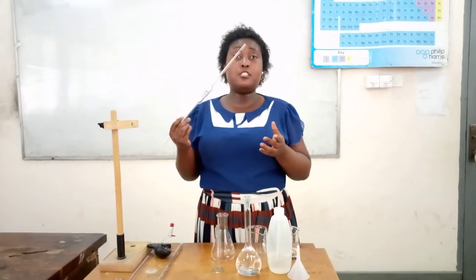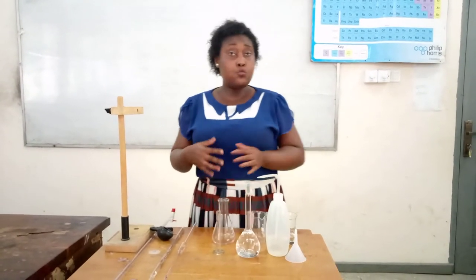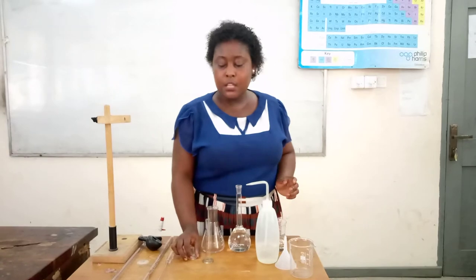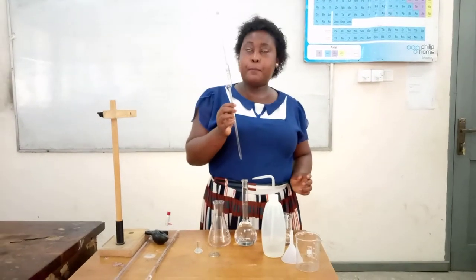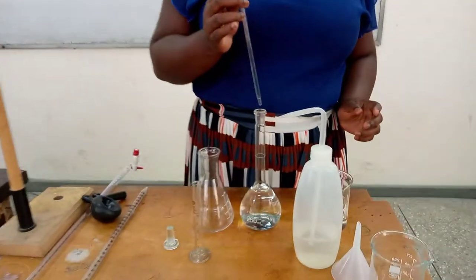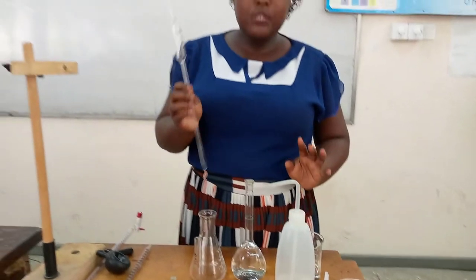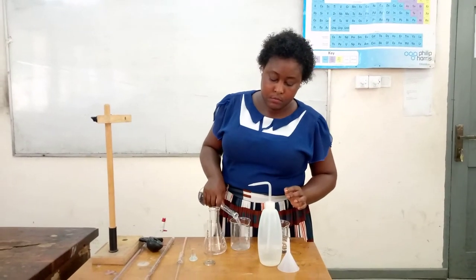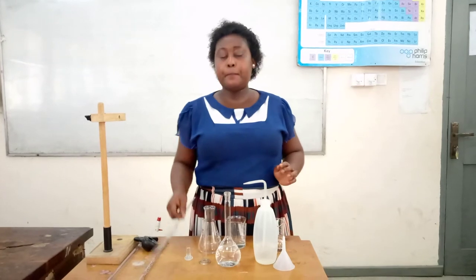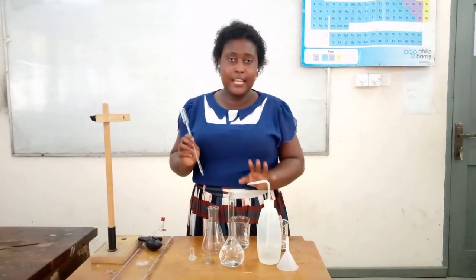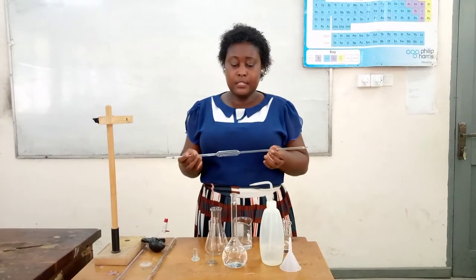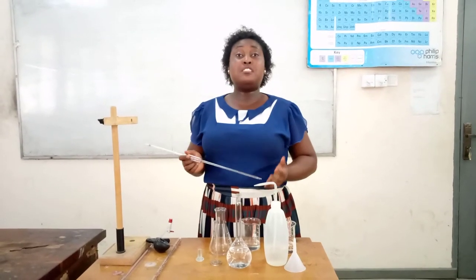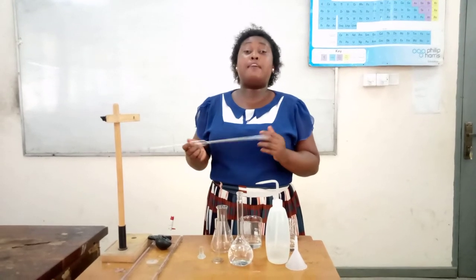My pipette is clean — I have washed it with distilled water. Now I can pipette the solution I am supposed to pipette. When you are pipetting from the solution, I have seen students who put the pipette directly into the volumetric flask to pipette from it. Please, you don't do that. You take another clean beaker, then pour a little amount of the solution, then you pipette from the beaker. Don't pipette straight from the volumetric flask — it is not done, it is unacceptable. Now I have to rinse the pipette again with the solution that I am supposed to pipette. You rinse it three times — the reason why we rinse it three times is to avoid dilution.